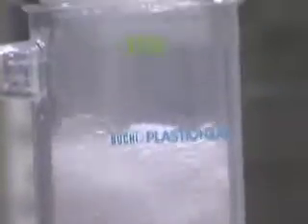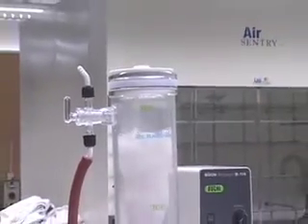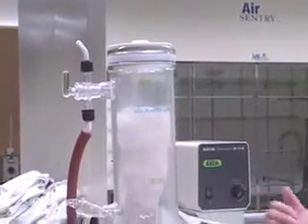So, once you add dry ice, put the cover back on. So, this is our cooling condenser.